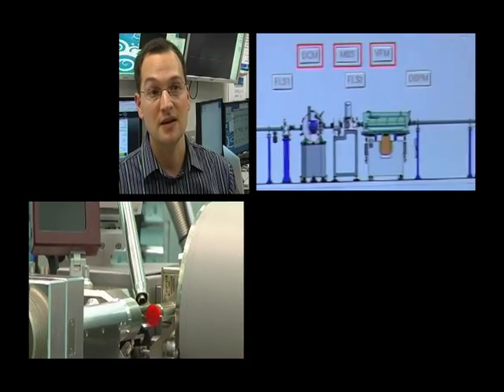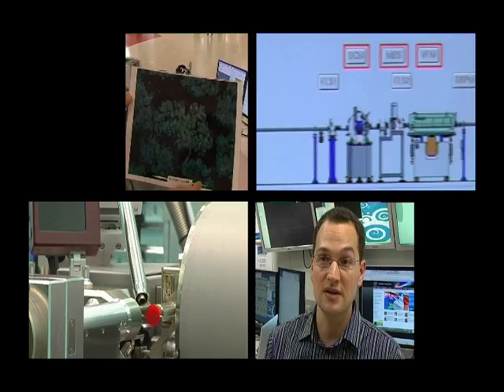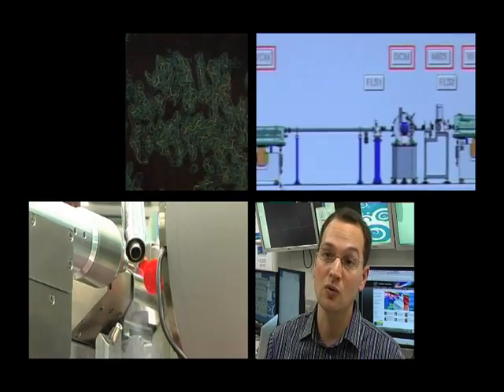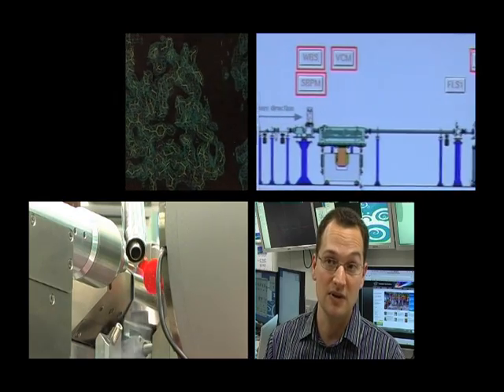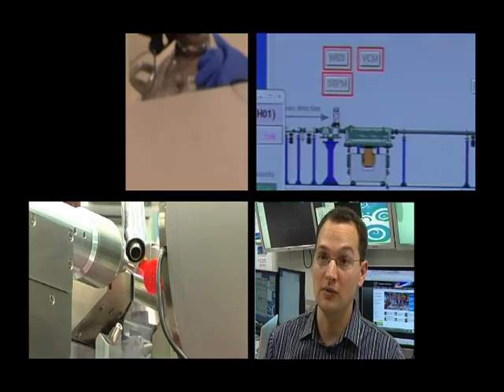With remote access, anyone in the lab, the students, the senior people, the junior people, they can all collect data on their own samples, and that spreads the synchrotron experience far wider. A lot more people learn how to use the synchrotron and use our beamlines.